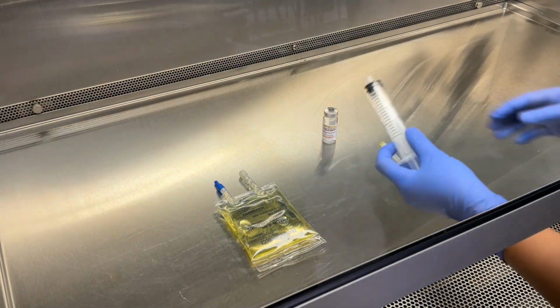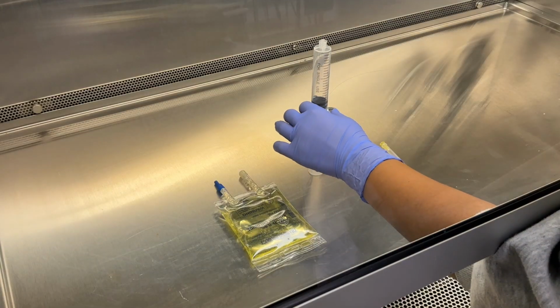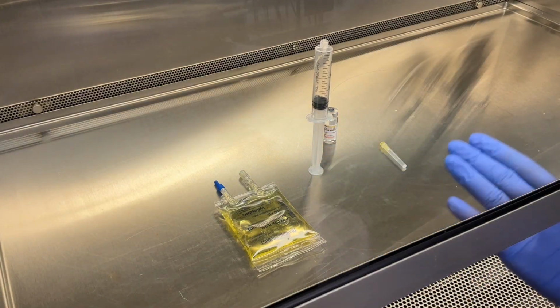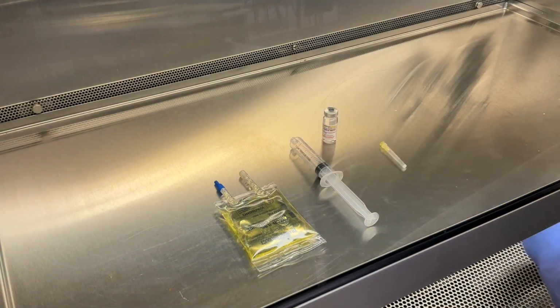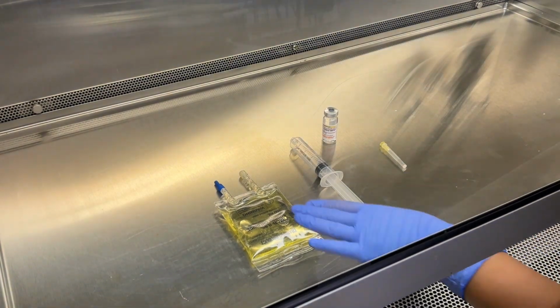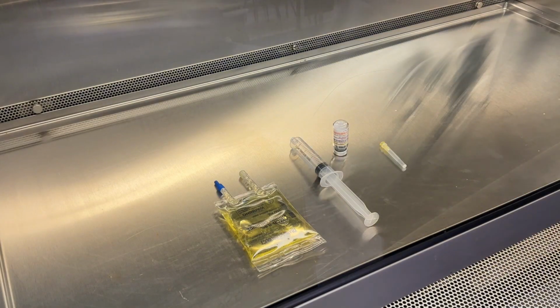If I had my plunger on my syringe extended, this would be considered unacceptable because the airflow isn't hitting the plunger. But this would be okay. And if somehow my vial turned upside down, that would also not be acceptable.